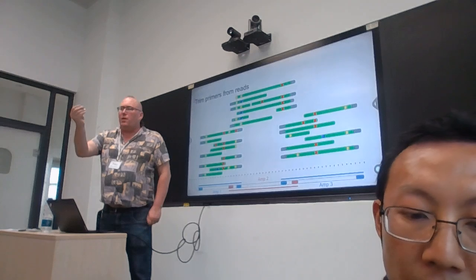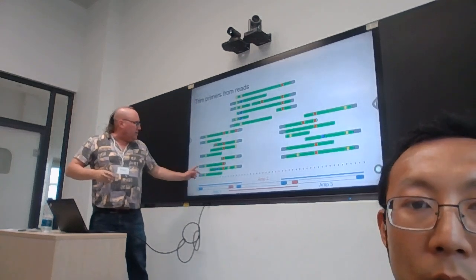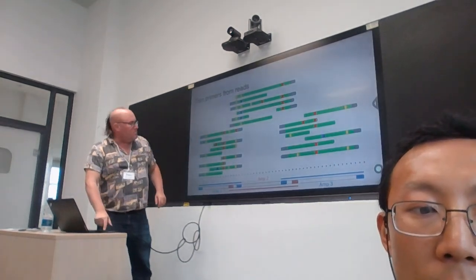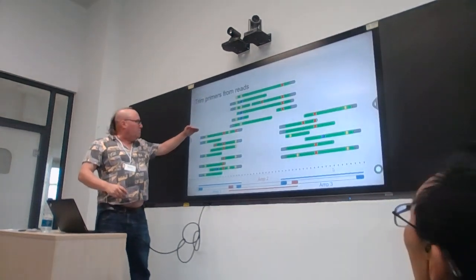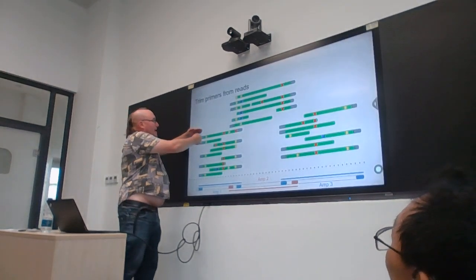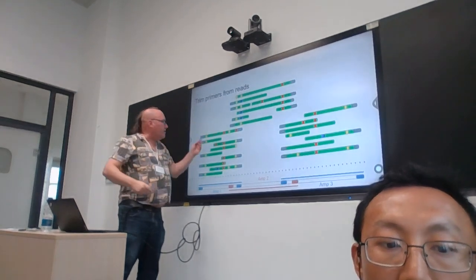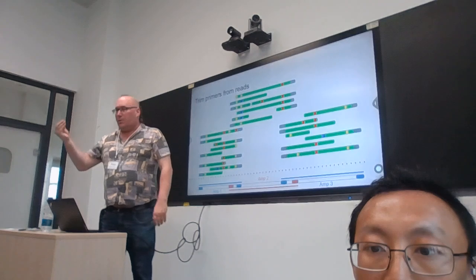What are we sequencing? We're sequencing an amplicon, the read, okay? Remember what's going on the screen. The DNA was binding here and it was extending from the primer sequence, right? When we were doing PCR. Which means that the pieces in gray are matching the primer sequence.